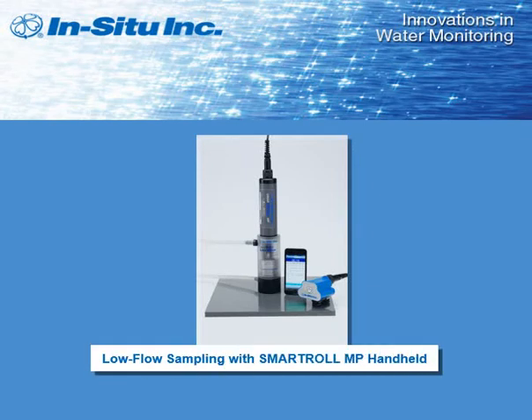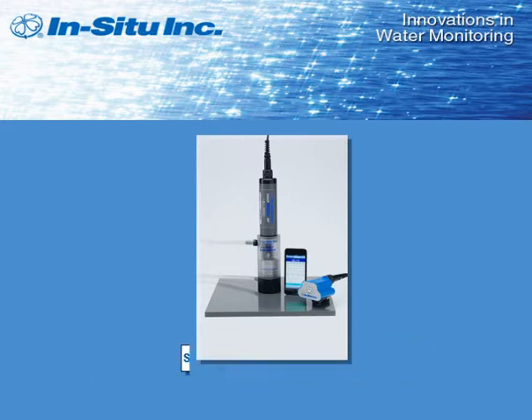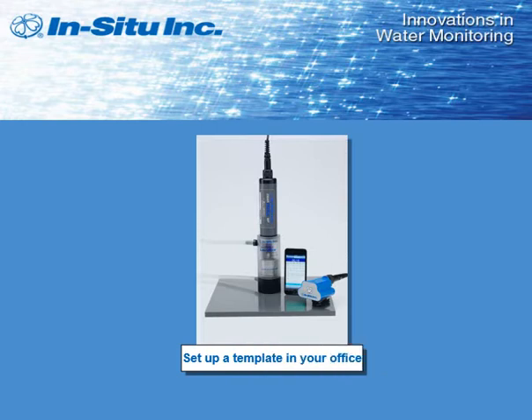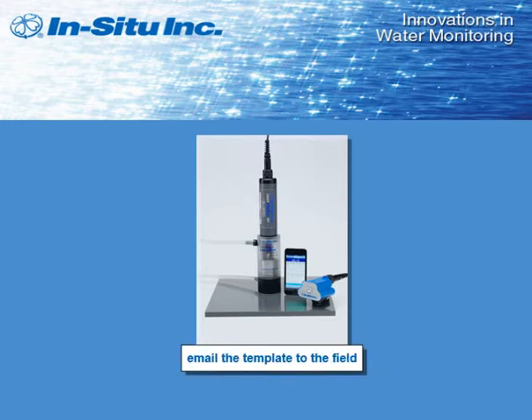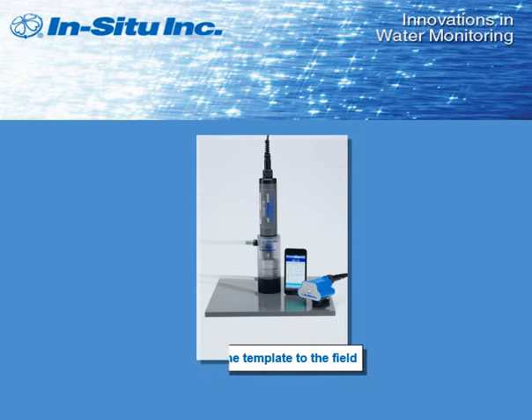Low flow sampling is easy with the In-Situ SmartTroll Multi-Parameter Handheld Instrument and the iSitu mobile app. You can set up a project template in your office and email the template to your tech in the field, or you can set up a project within the iSitu app.